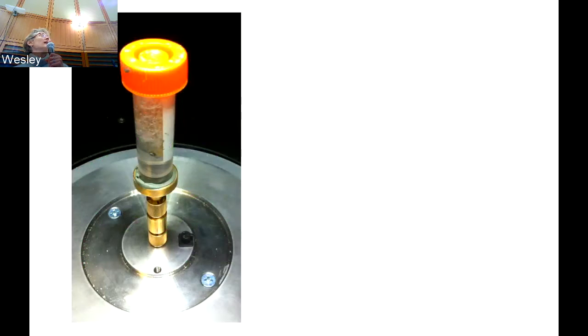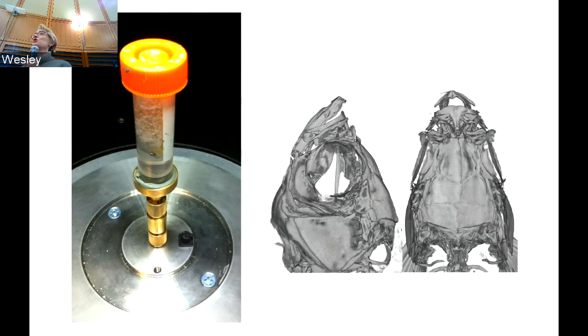Now, in the Harris lab, they use high-resolution microcomputed tomography, micro CT, and this is a nice complement to the data that we generate, because they of course are imaging fixed samples, and they can get extremely high resolution data that's equal resolution in all axes, unlike the confocal microscopy. And so it lends itself extremely well to doing three-dimensional reconstructions.